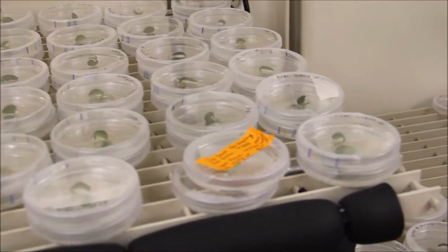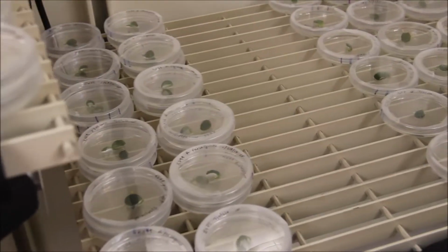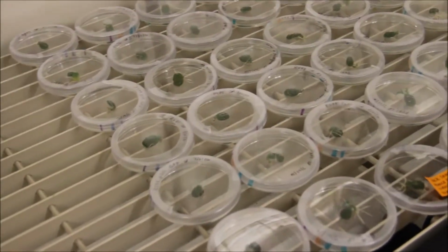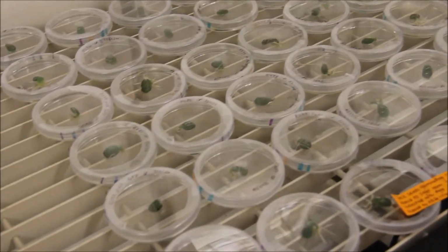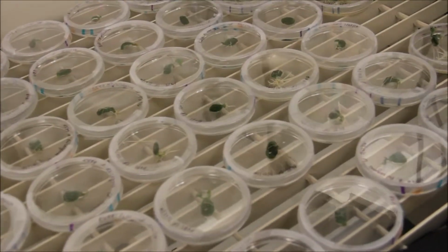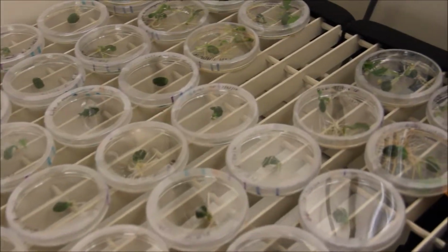After you infect your germinated seeds with Agrobacterium, over a period of several days and up to a week and a half, you will start developing hairy roots that come off of the cotyledon. Using selection or a reporter gene, we can determine if we have a transgenic event that we can use in an assay.